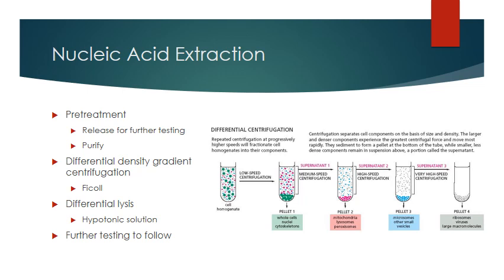In a differential density gradient centrifugation, you basically mix either your blood or your bone marrow, whichever you're using, with isotonic saline, and then you overlay it with a solution like Ficoll solution, or Ficoll's reagent actually, which is a highly branched sucrose polymer that isn't able to penetrate biological membranes.